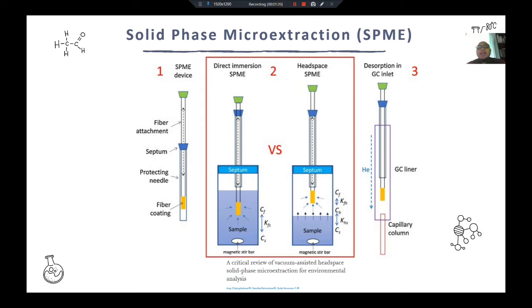Okay, and SPME fiber, if we do the maintenance, one fiber we can use 100 times, okay, more than 100 times usually. Okay, but if you don't use it carefully, that's why it can get broken. Okay, because the fiber is quite fragile, actually quite fragile.